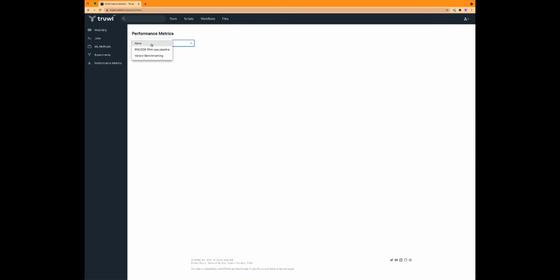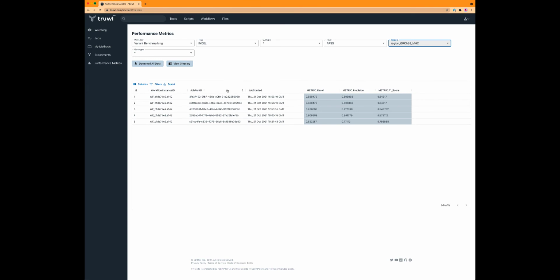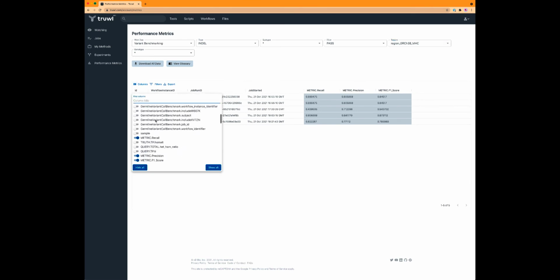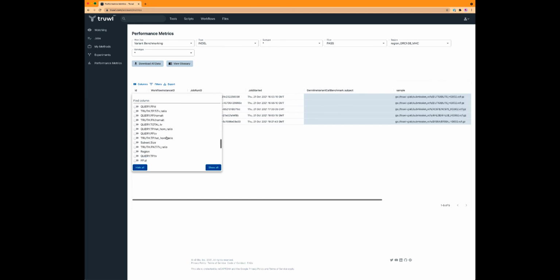Unique to this system is an interactive dashboard specifically designed to compare runs across truth sets, tool choices, and parameter distributions. The interface and internal implementation borrow concepts of model and hyperparameter exploration tools from the machine learning community.